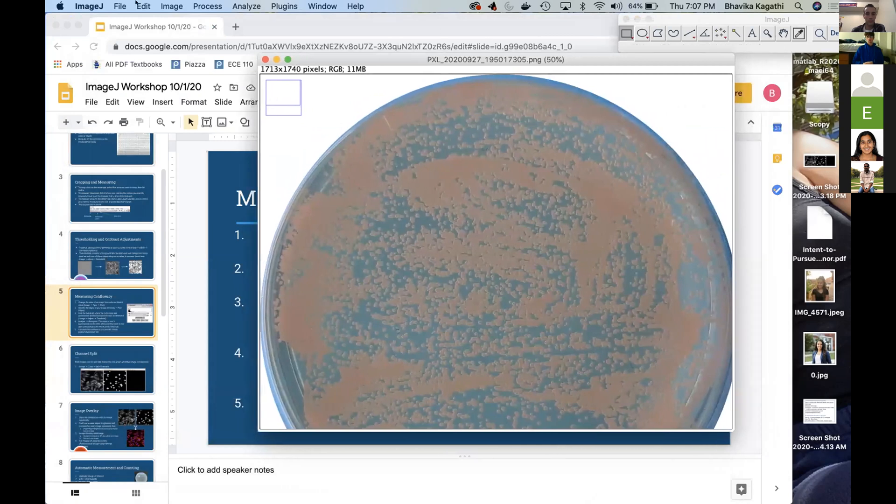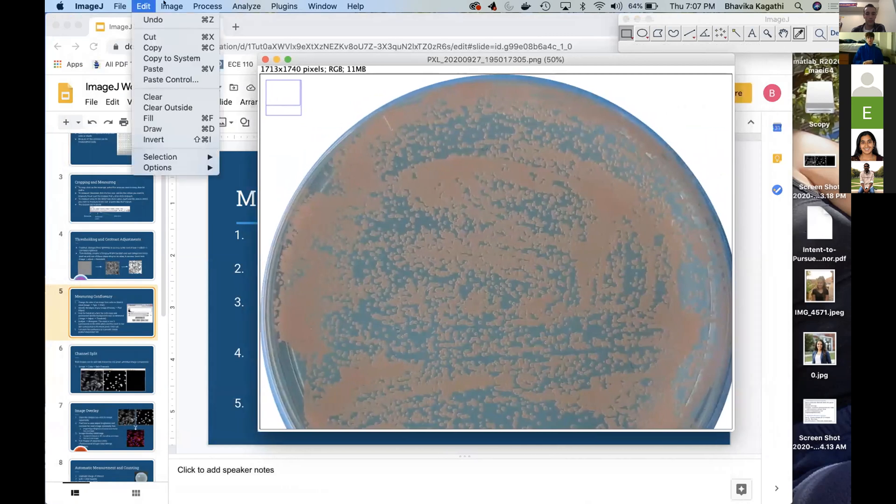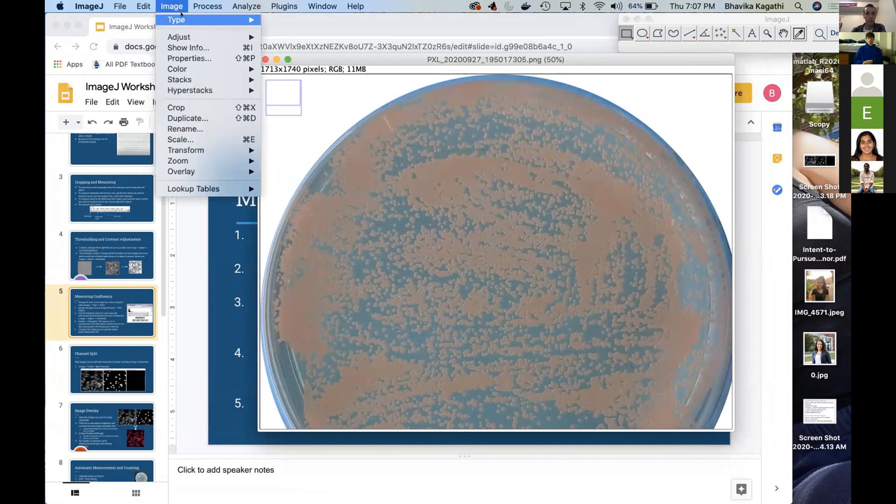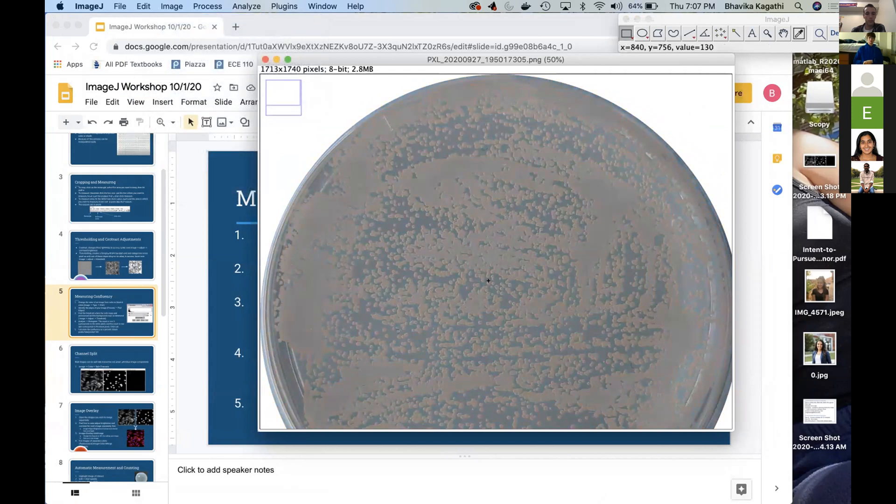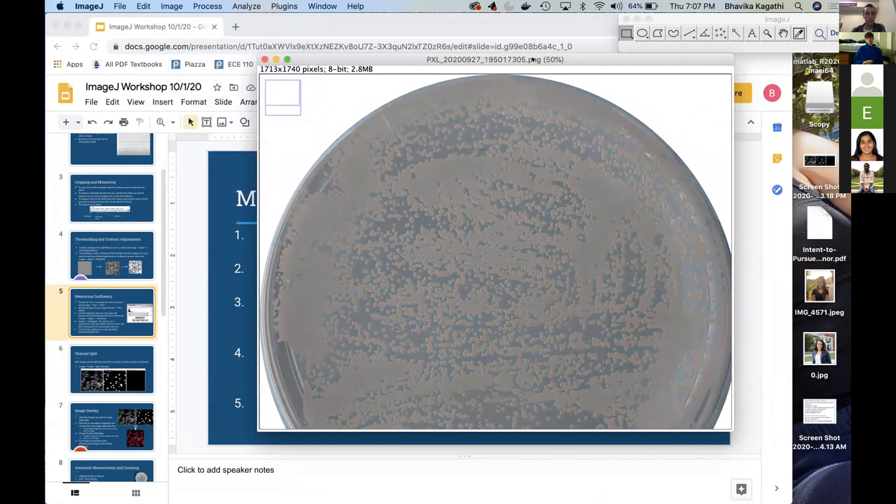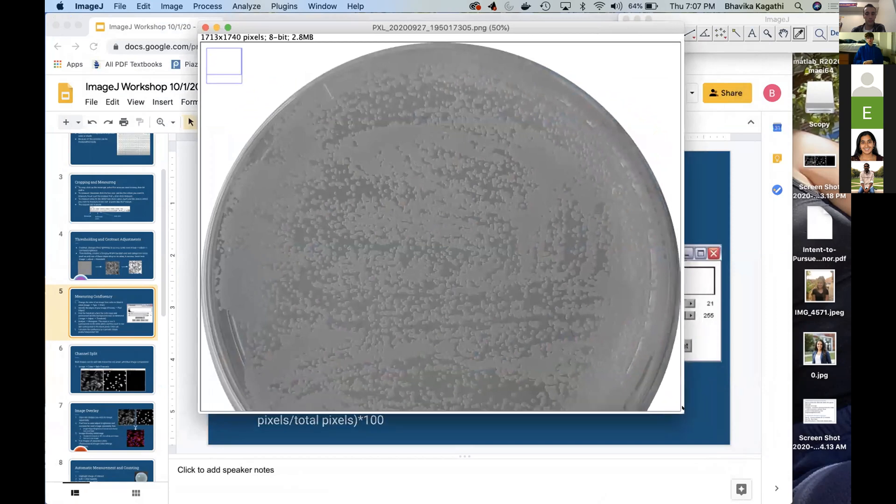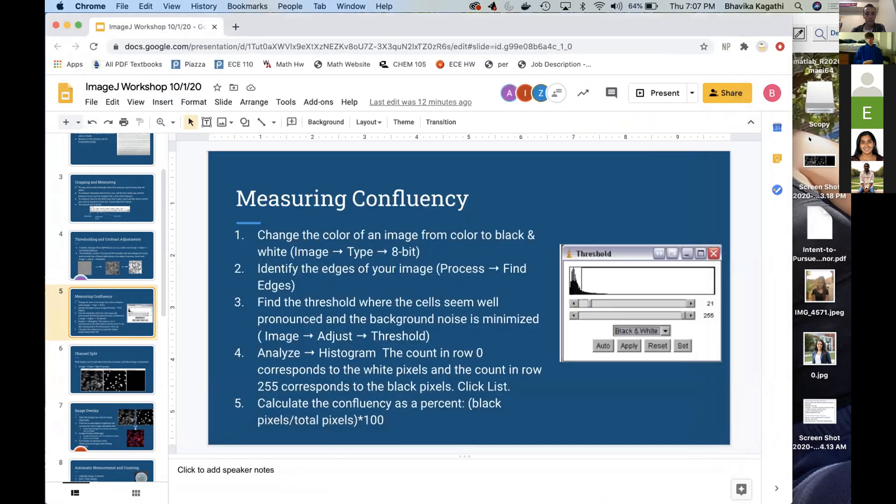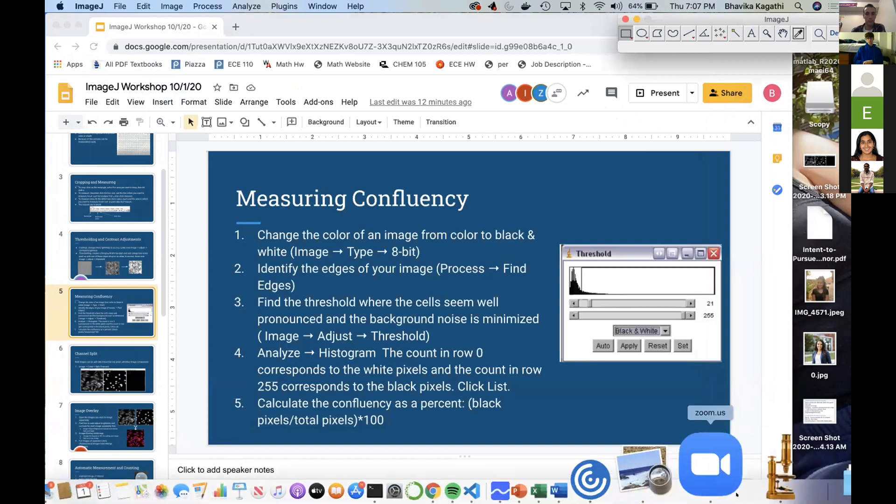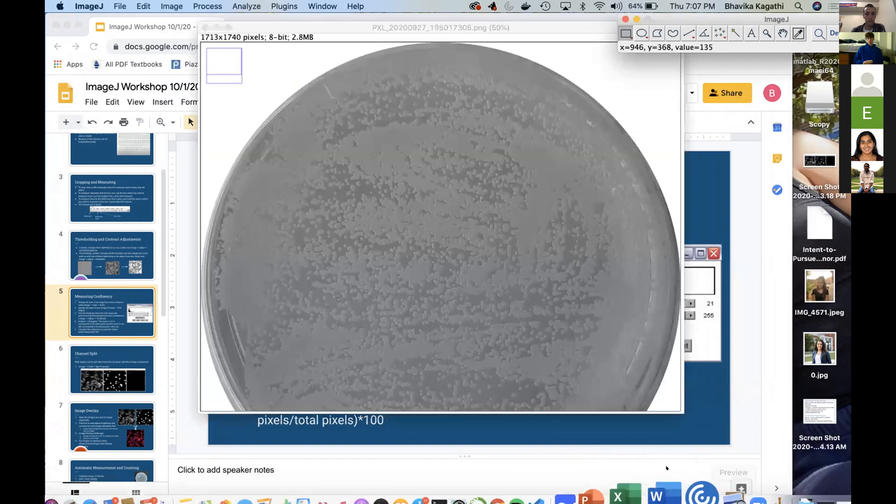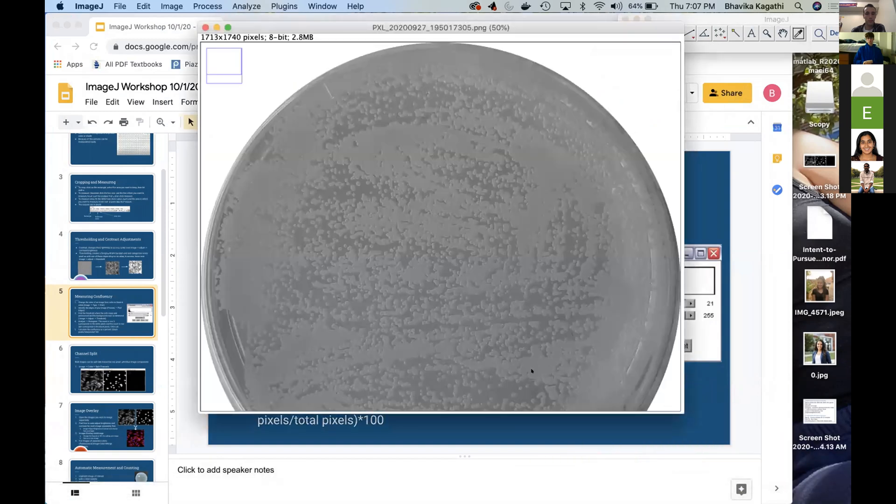So you're going to go to Image, Type, 8-bit. And by clicking 8-bit you will be able to convert your image to black and white.